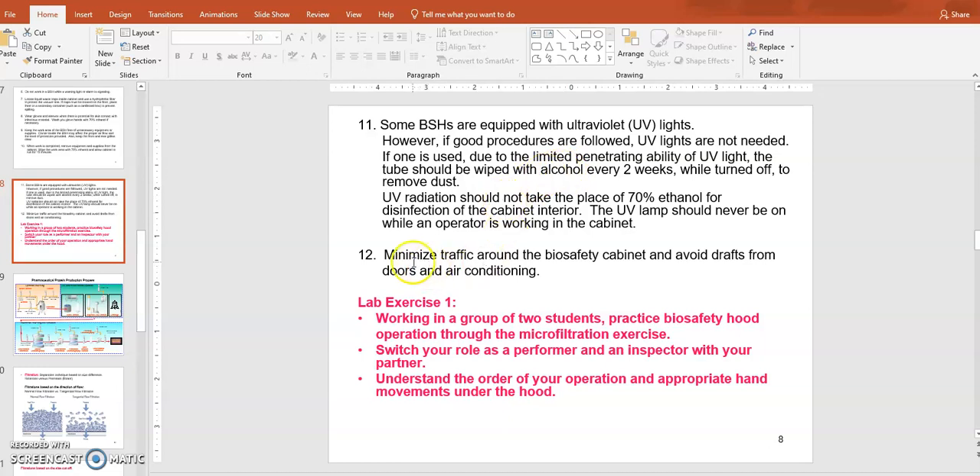Minimize traffic around the biosafety hood to avoid any air draft. Especially, don't place the hood right next to a door where airflow will happen very strongly. These are kind of common-sense rules to keep in mind. For exercise number one, you will be asked to do some work inside the biosafety hood — specifically an aseptic microfiltration exercise. Make sure you clean up the biosafety hood work area, organize the workspace, carry out the work, and clean up when done.